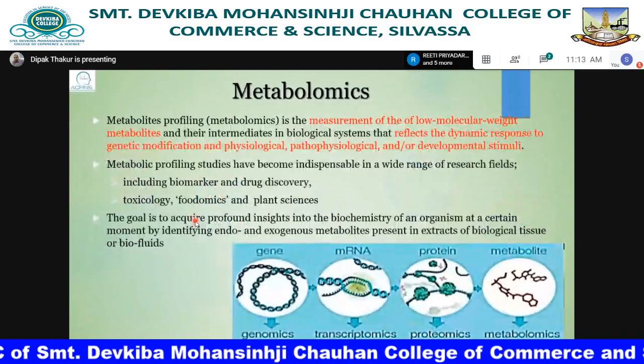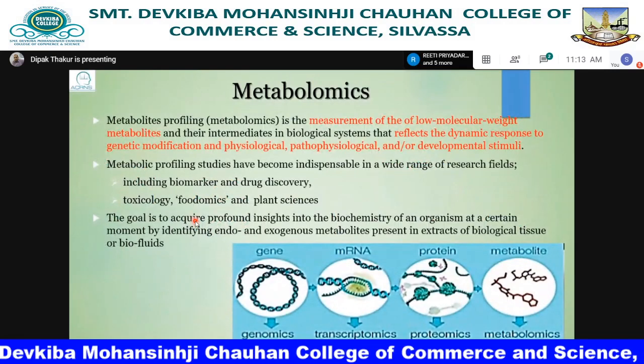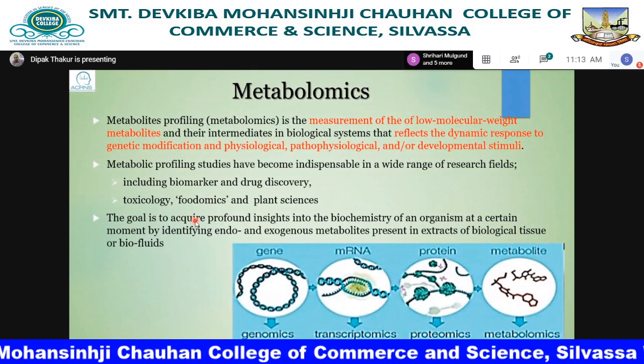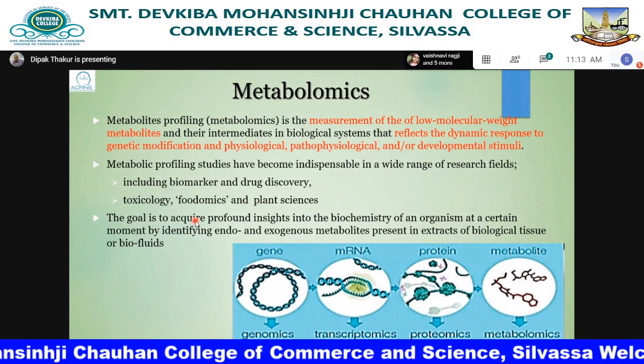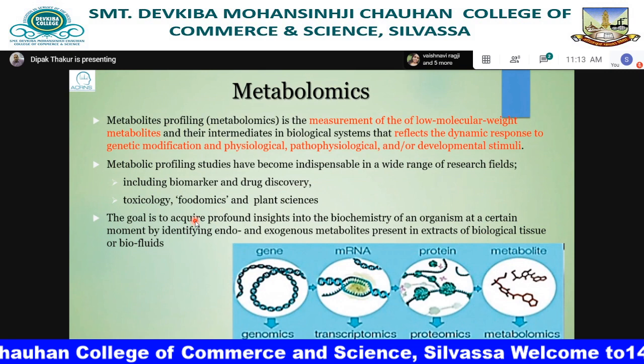So as I mentioned, one of the applications we are going to discuss of use of LCMS platform comprising of micropack column is metabolomics.